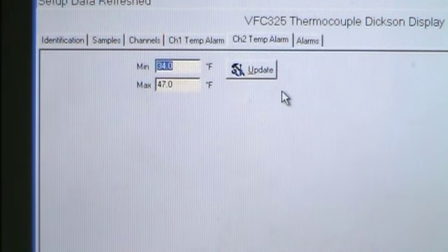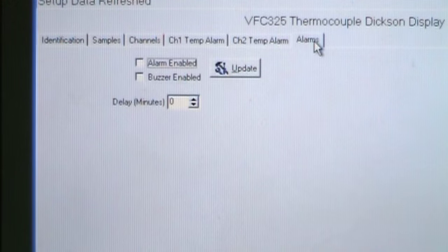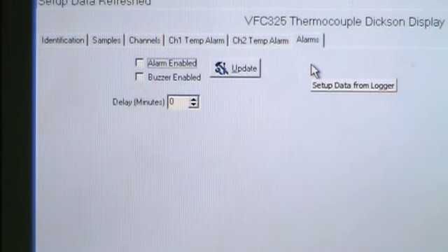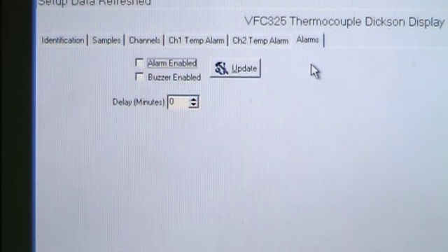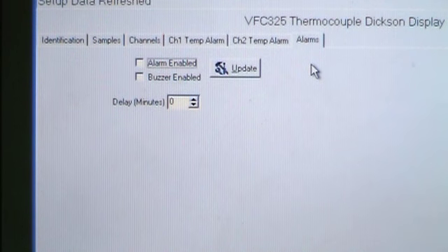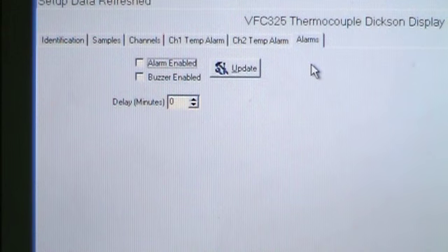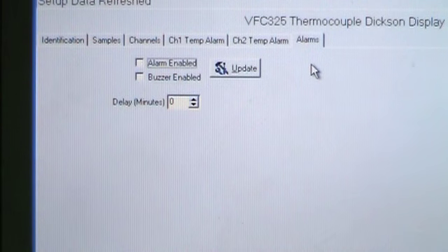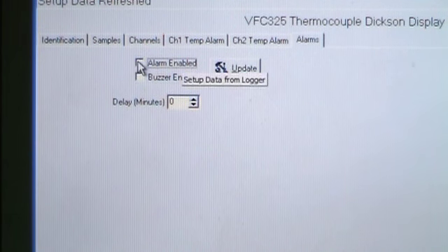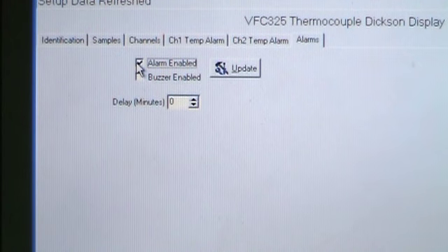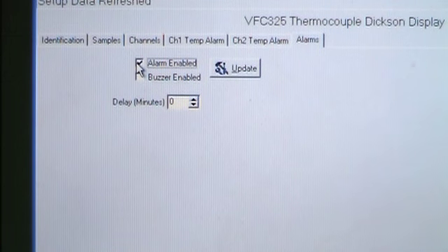Choose the Alarms tab to set the alarm temperatures. There are two alarm indicators: ALRN, which flashes on the display, and audible alarm buzzers. To display ALRN across the front of the display if temperatures go out of range, click Alarm Enable. For an audible alarm if temperatures go out of range, click Buzzer Enable.